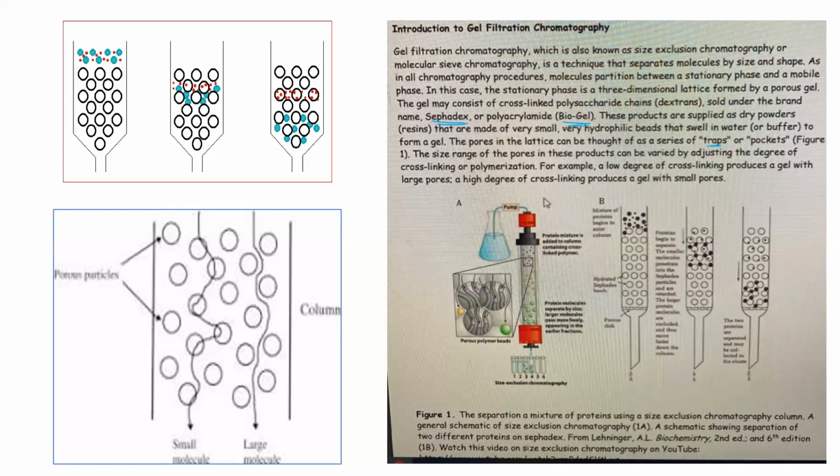Again, it's column chromatography, so you also get ready-made columns. Okay, but they are very, very expensive. So most people prefer to order these dry powders and pack them manually in the laboratory. While packing, you have to make sure that you don't just pour the powder directly into the column. First, you need to equilibrate the column. Equilibration is with whatever your mobile phase is going to be.